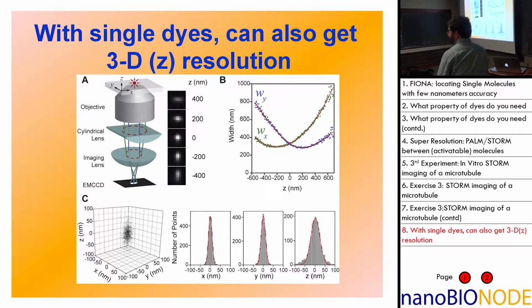Professor? Yeah? When you set like an image like this, do you know one whose value negative 400? Yes. Just that single little dot. Just that square? Well, yes. Okay. Just this. It's not a square. It's more of a rectangle. Yeah, sorry. Yeah, so we would just look at the negative 400 value to see what the maximum is in the X.